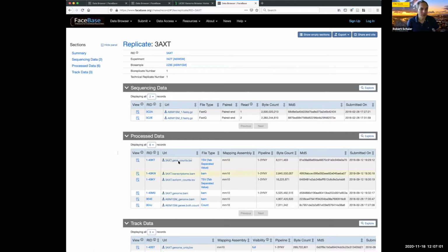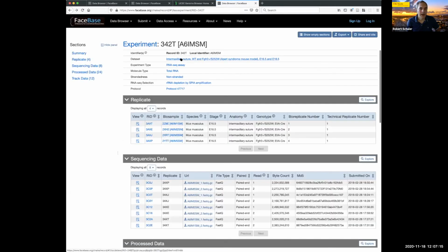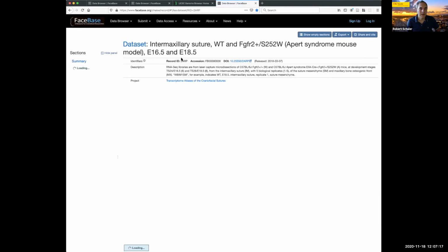So that's what you get from all of these, but that's, again, probably not, especially with a large data set, the way you would want to experience this. Okay, so let me just work my way backwards here. And let me get back to that data set.